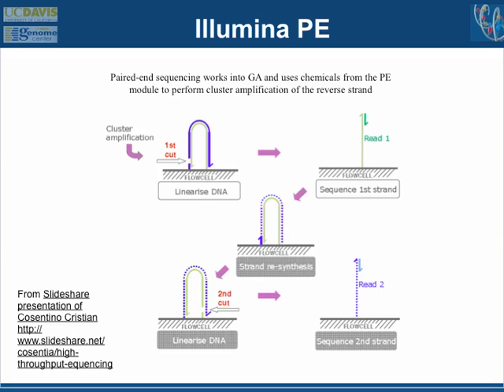So if you have a 300 base pair insert, you can read 100 base pairs on one side and 100 base pairs on the other, and get paired end sequences that are 300 base pairs apart, but you read the left and right 100 base pairs. The new DNA sequencing chemistry for Illumina, they claim, can get up to 250 base pair reads. So you can now imagine doing a 500 base pair insert and reading both ends and getting overlaps of that.